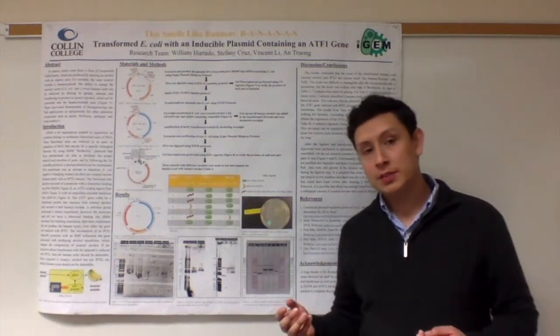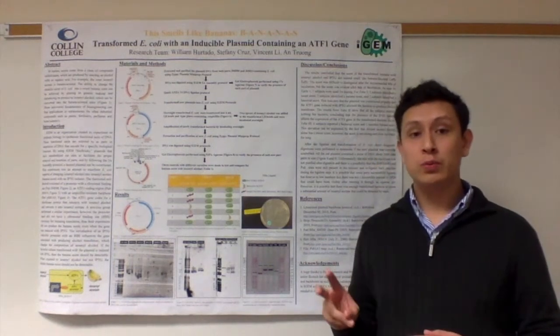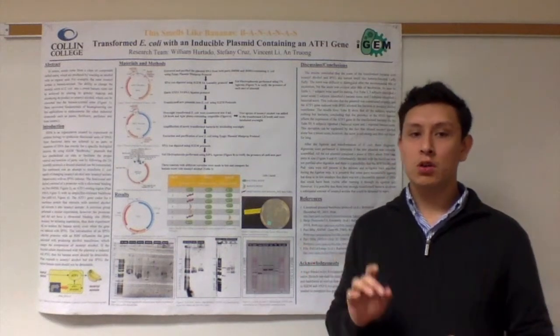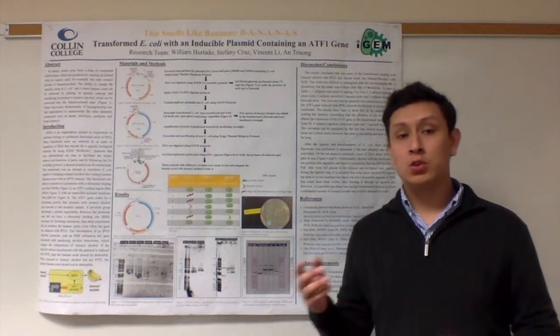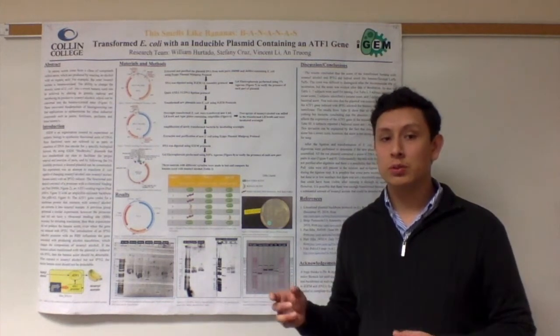To test for the banana smell, we created two more control groups for different variables. Tube 2 contained more transformed bacteria with isoamyl alcohol, however, no IPTG, therefore no inducer to create the banana smell. Tube 3 was a mixture of untransformed bacteria with IPTG and isoamyl alcohol.